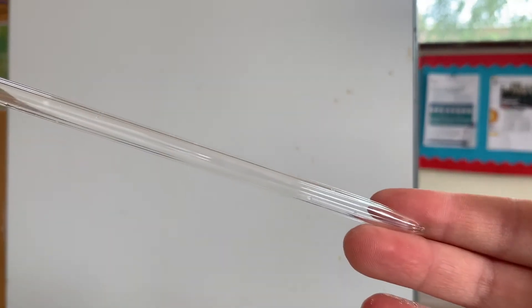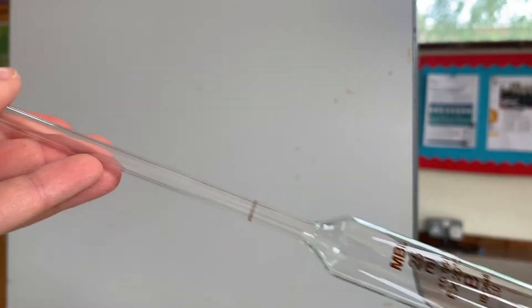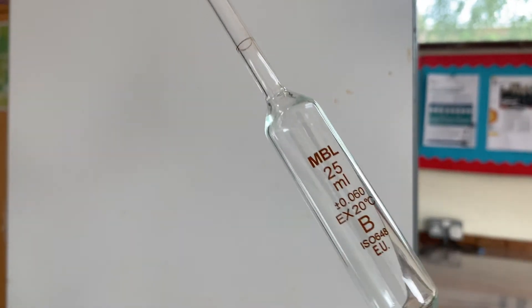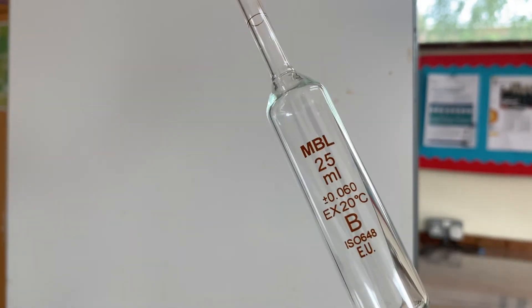First I need to measure out 25 centimetres cubed of the known concentration sodium hydroxide. I'm going to use this piece of equipment — a volumetric pipette, specifically designed to measure out 25 millilitres of liquid. You can see this pipette has a tolerance or inaccuracy range of plus or minus 0.06.